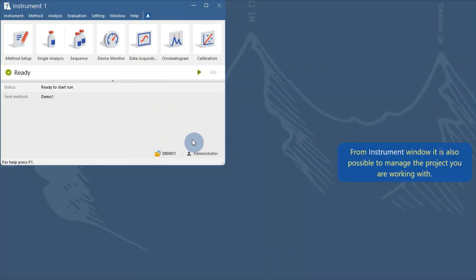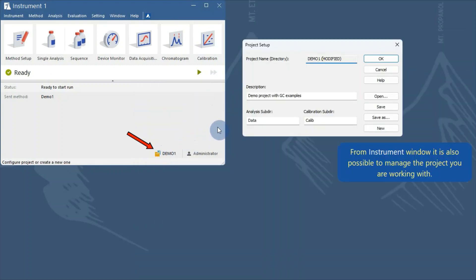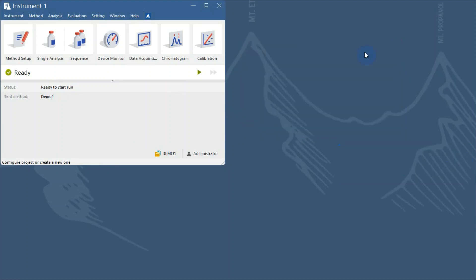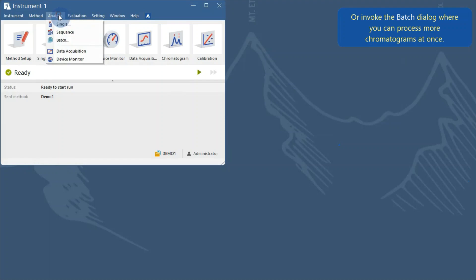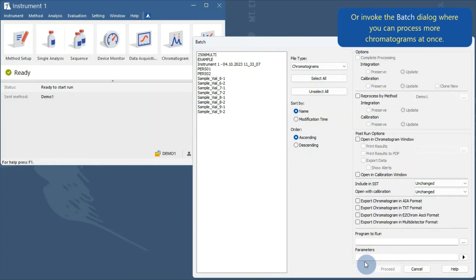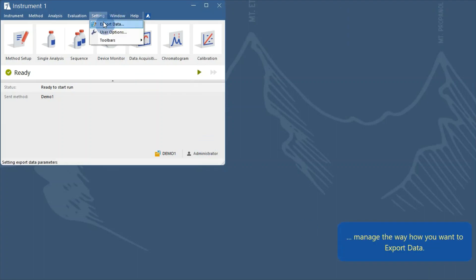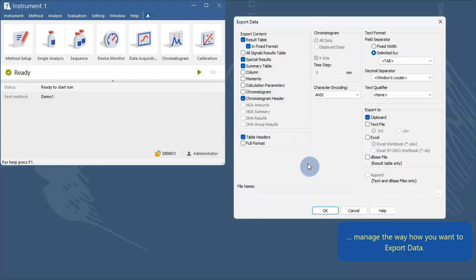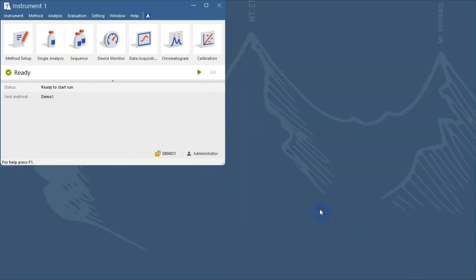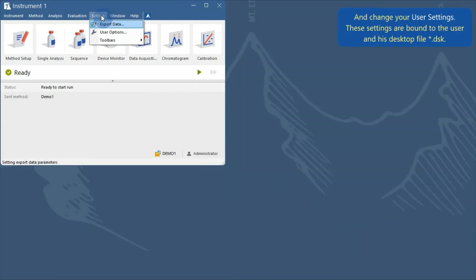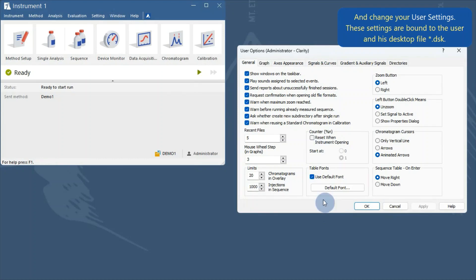From the instrument window it is also possible to manage the project you are working with, or invoke the batch dialog where you can process more chromatograms at once, manage the way you want to export data, and change your user settings. These settings are bound to the user and his desktop file.